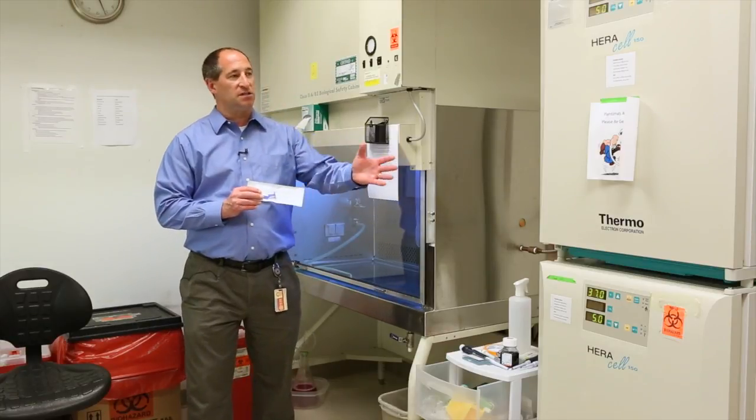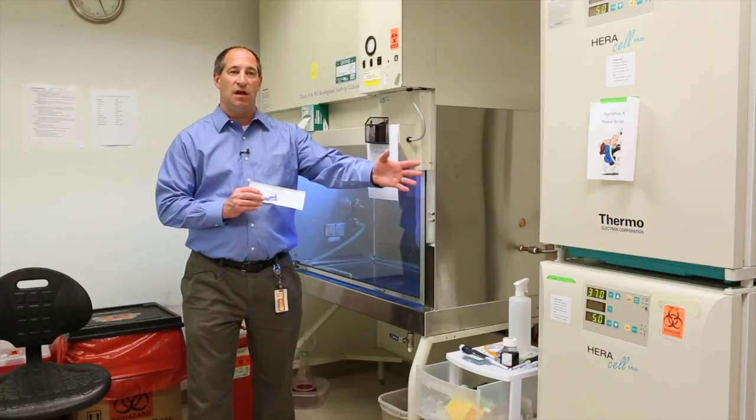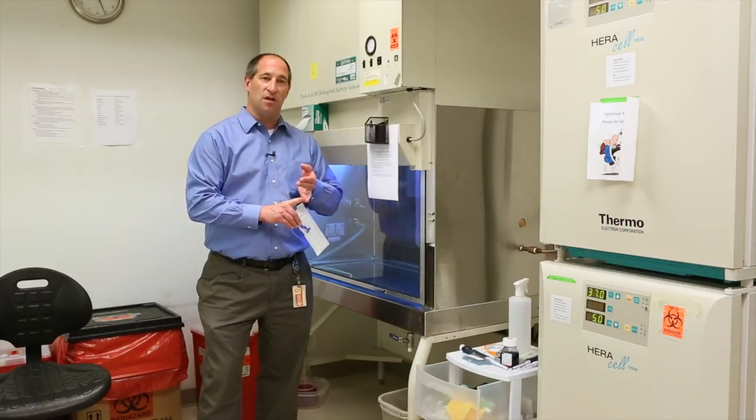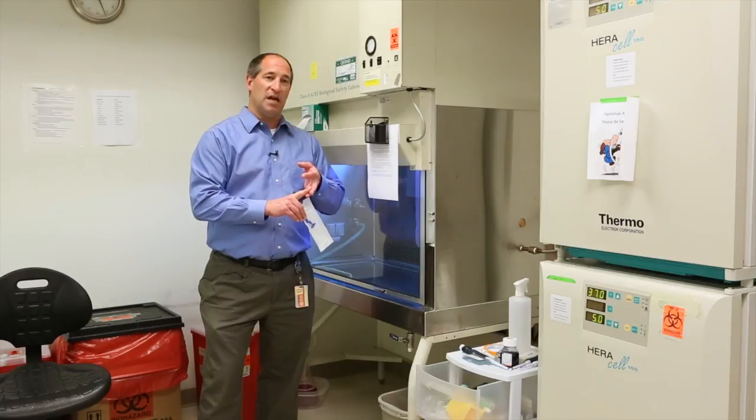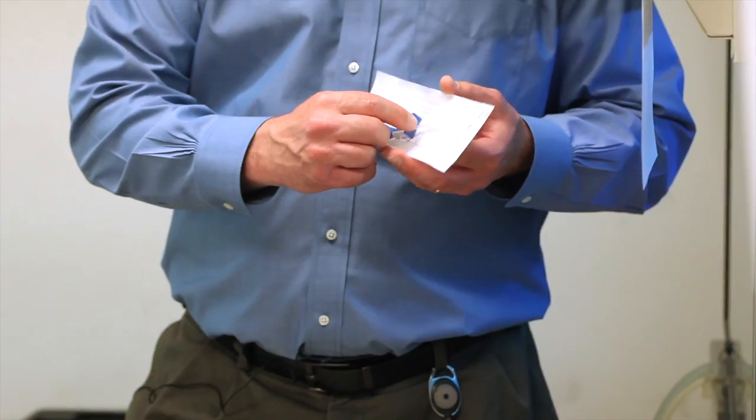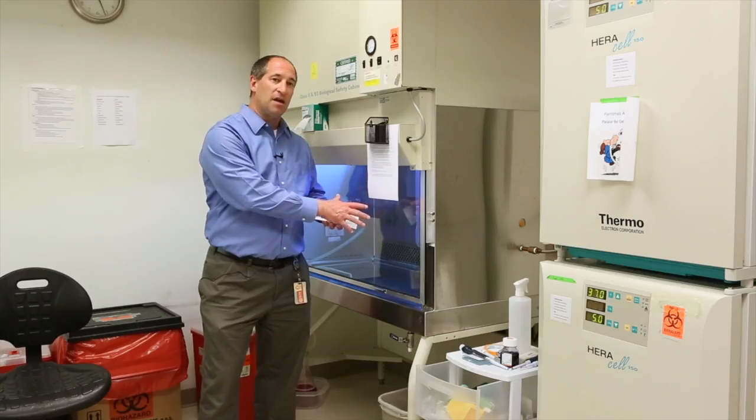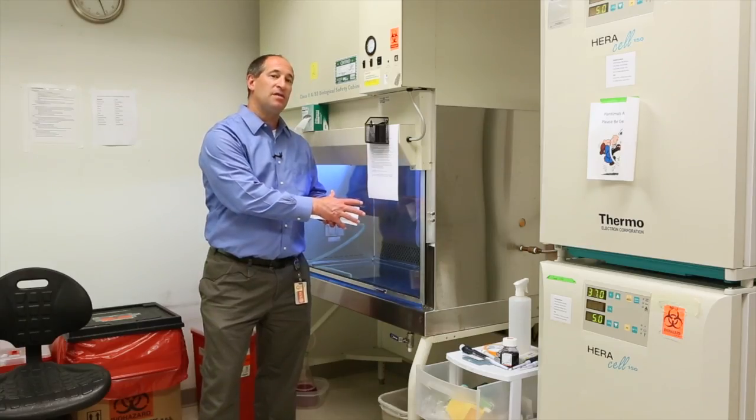We take the cells out of the incubator and keep track of the passage number, lot number, and how many cells we actually use. We add them into this little tube inside the sterile environment of this biosafety cabinet.